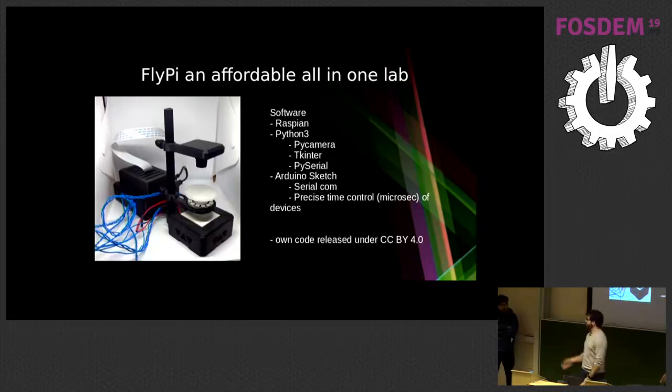What is the image resolution of the camera? So the question is, what is the image resolution of the camera? For the Pi camera, you have two versions. One of them is 5 megapixels, and the other one is 8. Right now, 5 megapixels is more than enough for what we need. The problem here is not how many pixels you can put inside the sensor, because they're already 1 micron apart from each other. So the pixels themselves are small enough. The problem is the optics, or some smart algorithm to process the data and get it working.